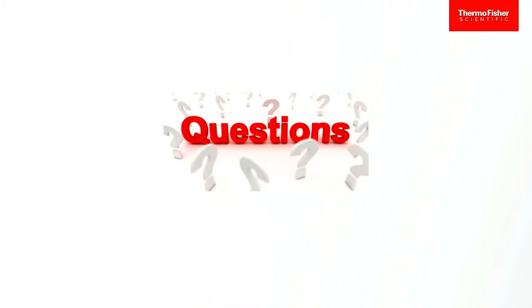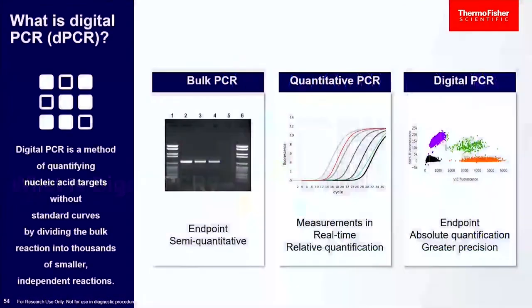All right, so we've got just a couple minutes to introduce digital PCR. I know your brains are full. Give me just a minute. Okay, so what is digital PCR? It is a hot topic right now, isn't it? You're reading papers, it's exciting, it's our new tool.